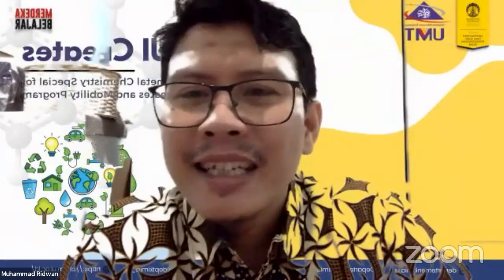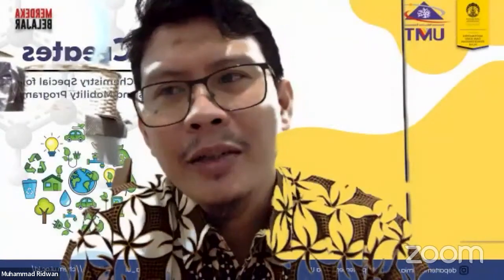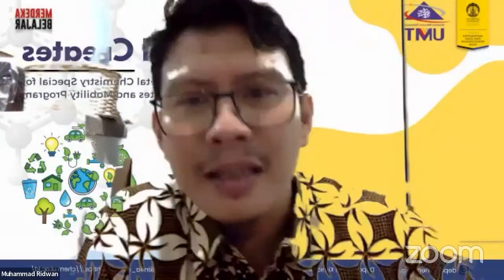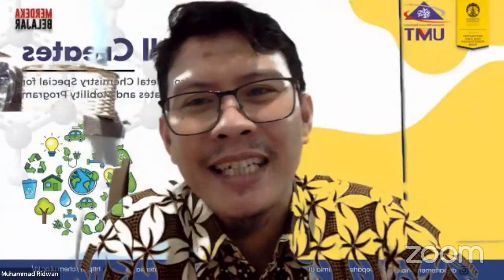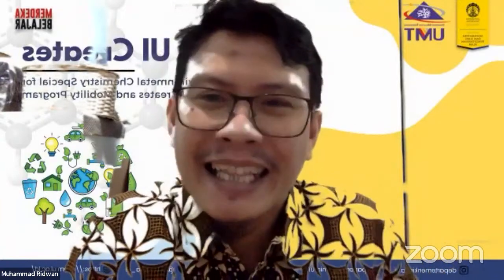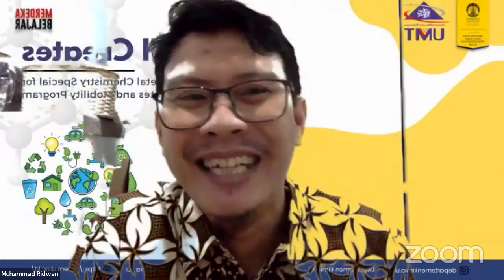So regarding this, Professor Yatima, as we know, you mentioned you are also sensing viruses. For example, probably last year you tried sensing the COVID virus. The amount of the virus is very small, I mean, very low. Can you get that limit of detection of the virus in your previous research about the COVID virus, Professor? Maybe you can share with us.